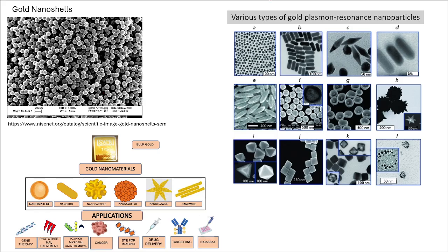Now, how does this look? You will see something like this. If you look clearly, these are three-dimensional kinds of images that you are observing. You can see the topography, and at some positions there is a gradient of black and gray. At some positions it's quite bright, at others a little darker. So there is a kind of gradient that forms. This is a 3D reconstruction kind of thing.